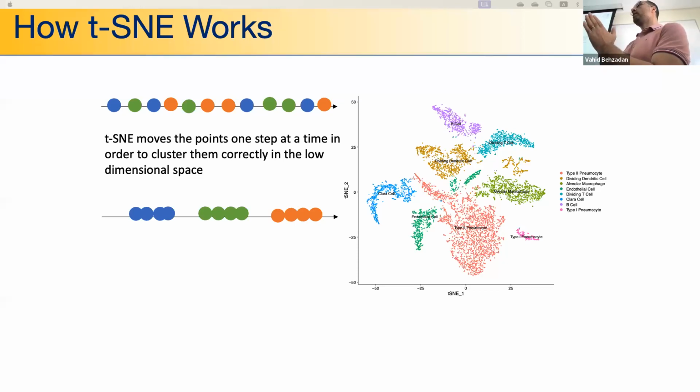If you take the difference between the two cells, you won't get zero exactly because some genes are different. But if the signature genes are active in these two cells, you can say that they have the same type, but they are not exactly the same. They do something different. Maybe we don't know what this functional difference is, but we're still calling them the same thing.